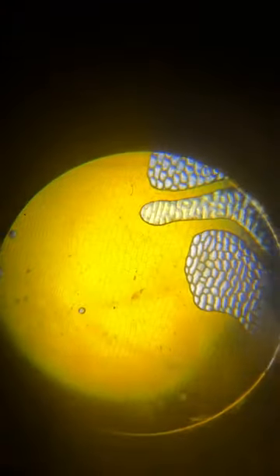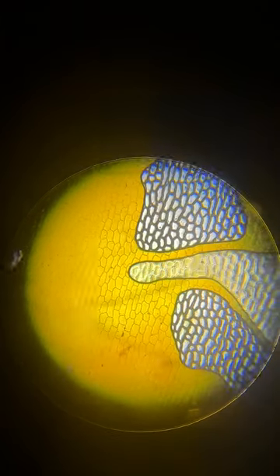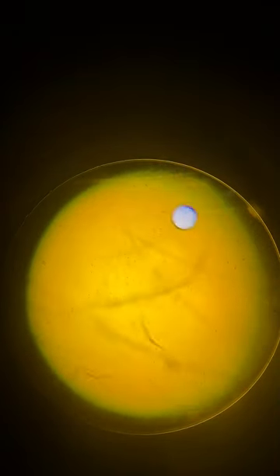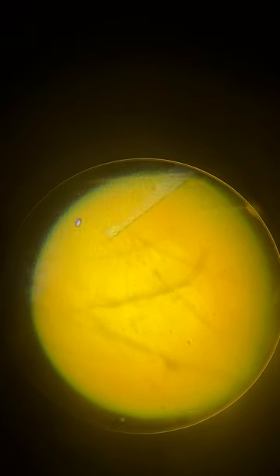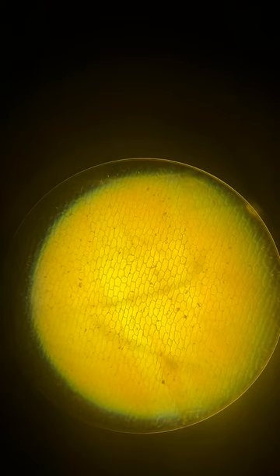This is what I'm wanting you to do on blue. When you go back to red, you can see those cells — hundreds of thousands of them. That's what you're looking for. Stay away from the whitish parts, and definitely stay away from parts where you can't really see any cells. Just scan on red, find a good spot, and then focus in on that spot.